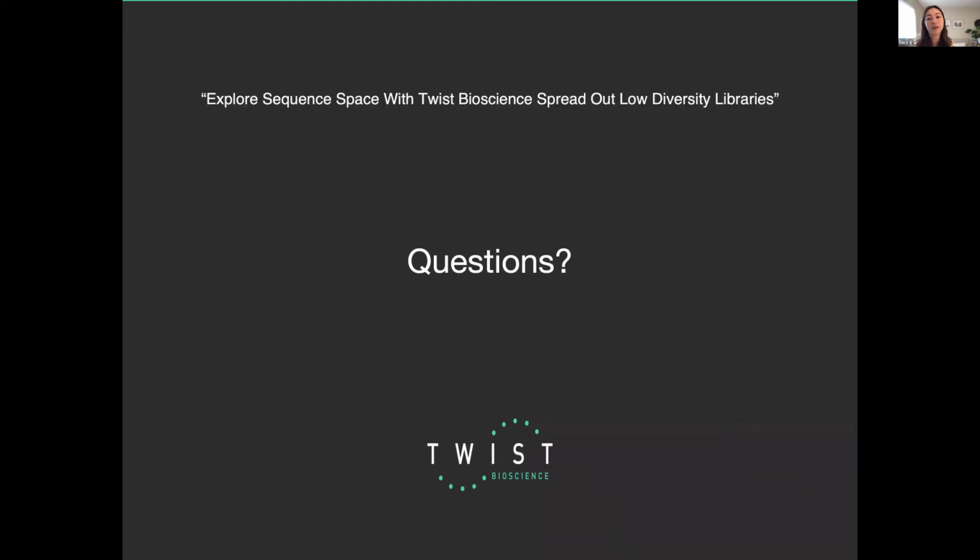So yes, around 2 weeks. And of course, if there are issues with the build, then that's going to increase the turnaround time a bit more. But in general, what we're seeing is that we're able to do the build in-house in 2 to 3 days, and the rest is just getting it ready for sequencing, getting the oligos designed, and getting them in our hands. Right.